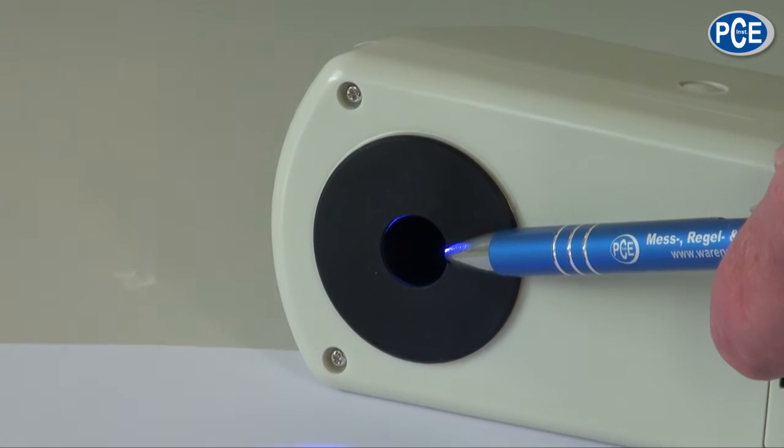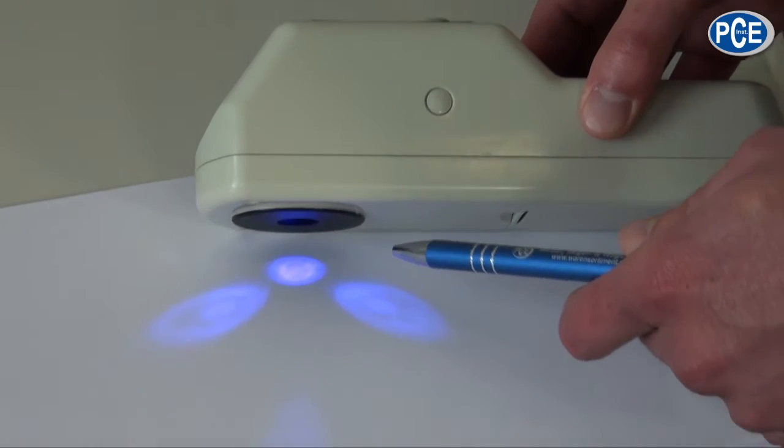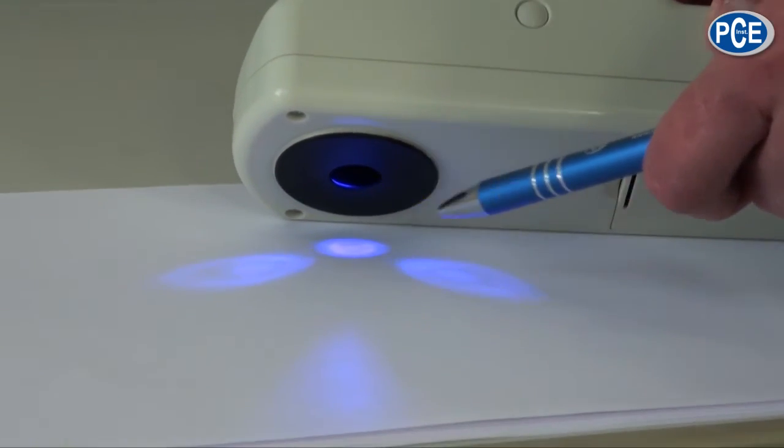Next to paper and textiles, you can also use the WSB1 to measure plastics, lacquers, porcelain, granulates, foam materials, and different powders. The measuring device has an opening of 15 mm. In the measuring chamber the D65 light source is built in, and the measuring geometry is 45/0.